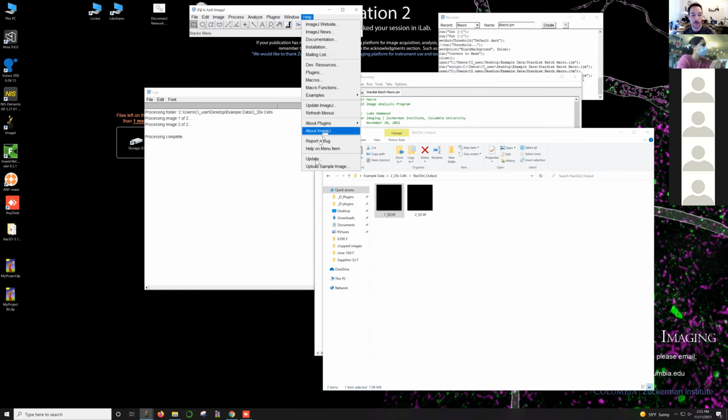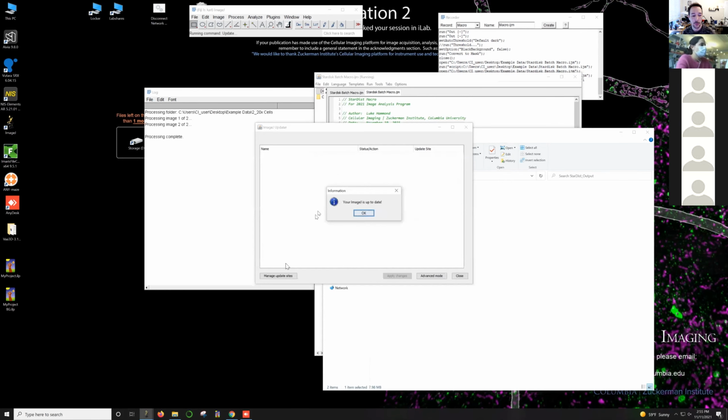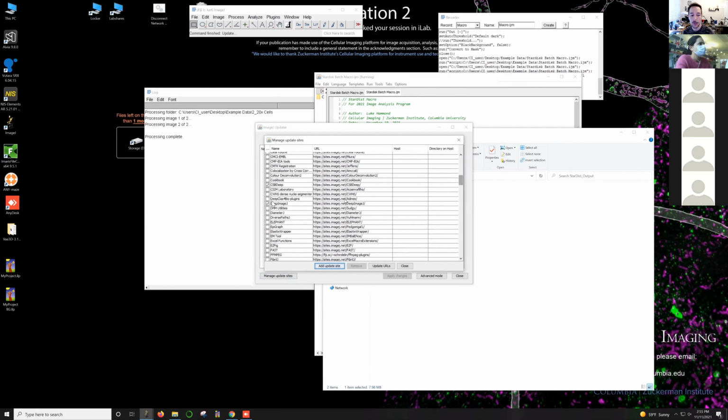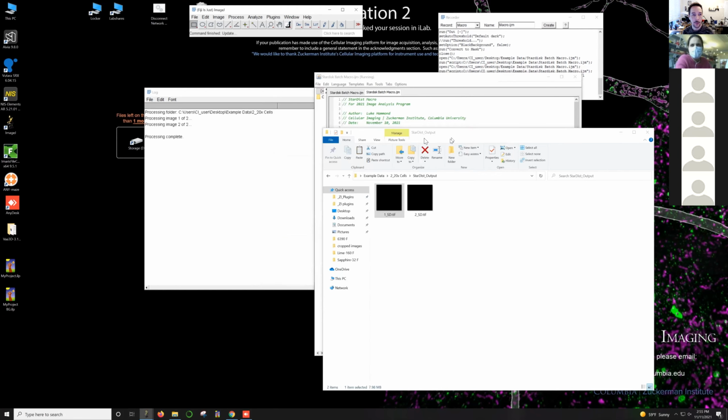And this again is just a very simple update. So if we go in here and have a look, you'll find the update site for it. It should be listed in Fiji. In here, DeepImageJ. And once you've got that installed, you'll need to restart Fiji.